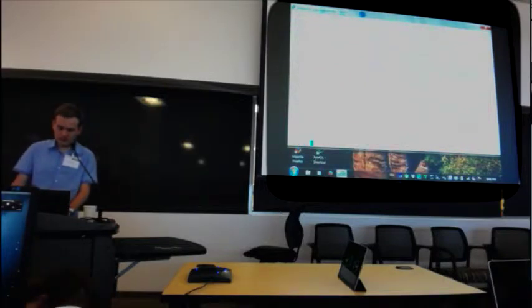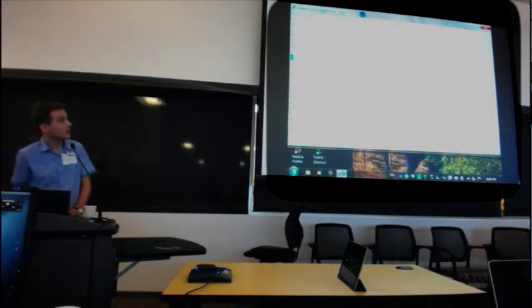So now let's have a look into the CSV file. It should contain all the run numbers and the associated dark files. Whenever there is a dark file, after a comma it says dark.